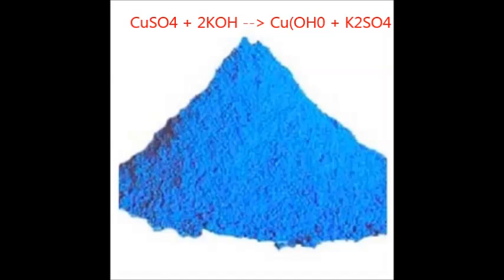In the higher ratios, there was an excessive amount of potassium hydroxide left over. In the lower ratios, there was not enough potassium hydroxide. In conclusion, the higher amounts of precipitate were due to the potassium hydroxide reaching the amount that made full use of the amount of copper sulfate.